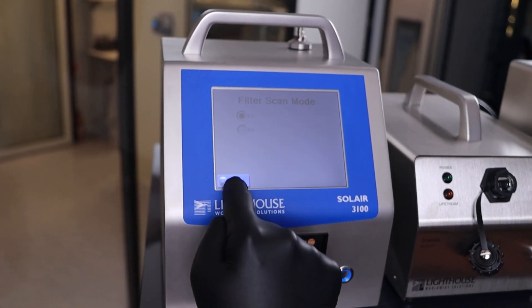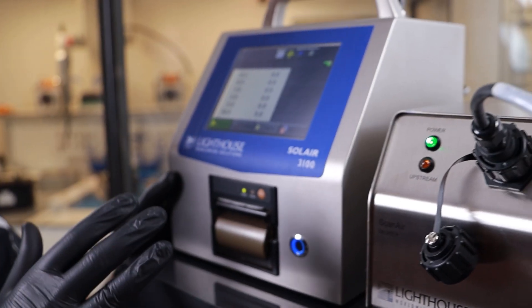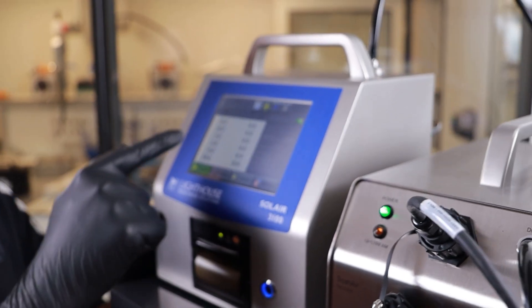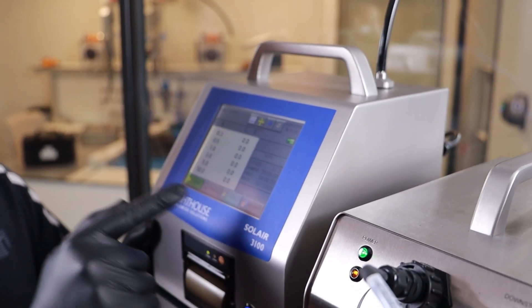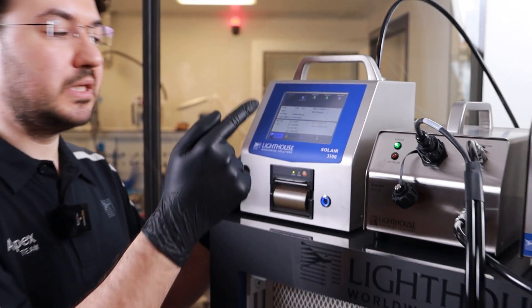First one is the Lighthouse Solair 3100 particle counter. This particle counter counts from 0.3 micron up to 10 micron. The same device can be used for filter testing as well as for clean room classification.